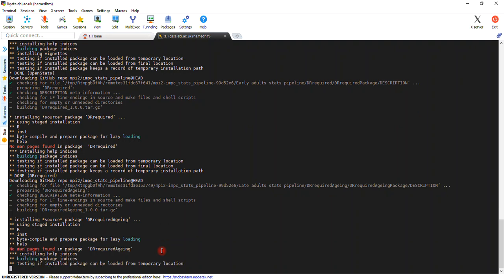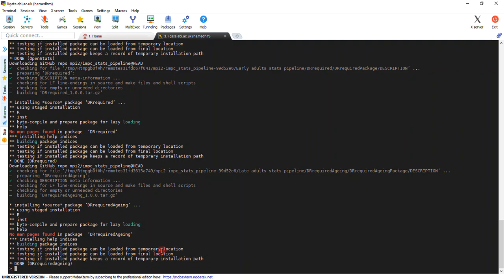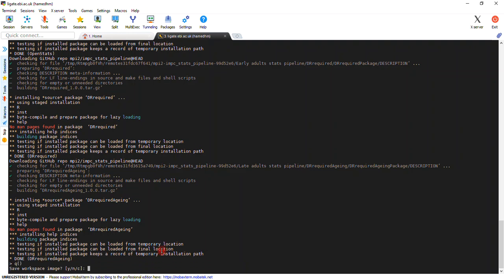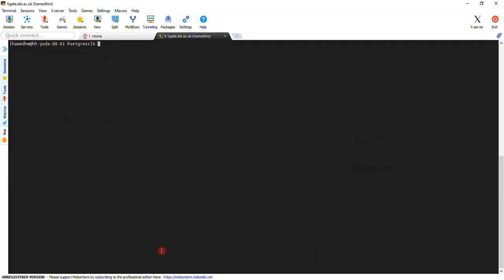It'll be done in a few seconds. Okay, it's done now. So I quit R and clear my terminal.